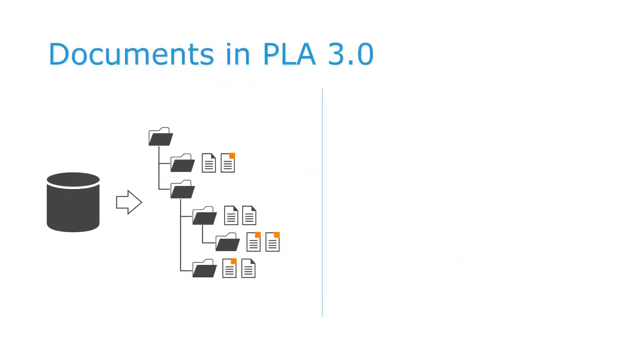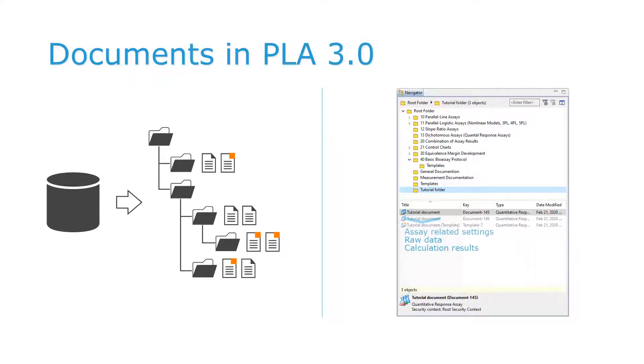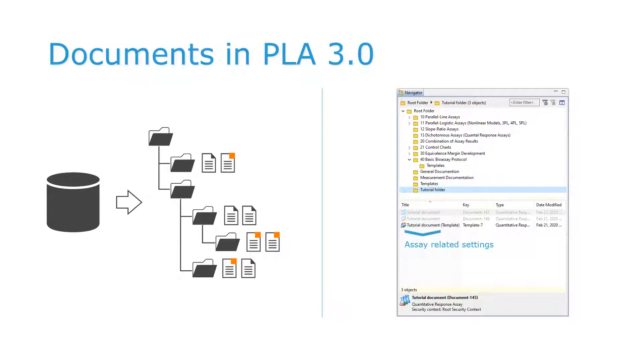Documents in PLA are stored in a database and displayed in a folder structure. When you work with biological assays, for example, documents contain all assay-related settings, the raw data, and the calculation results. You can also use template documents to define assay-related settings.